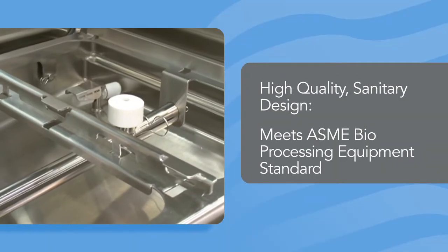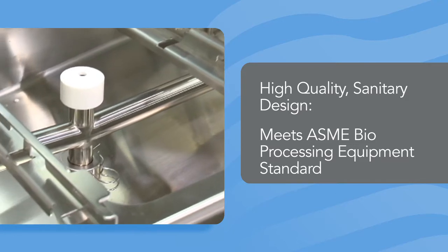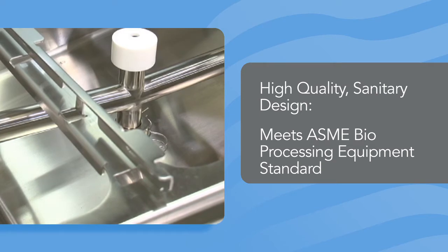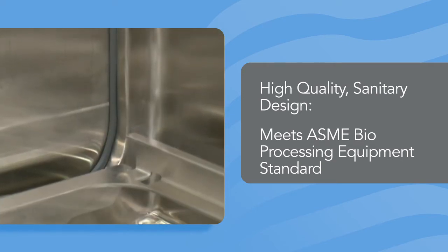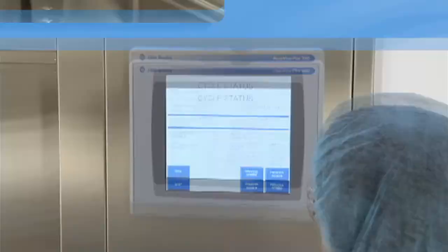The 380PG washer's sanitary design complies with the ASME bioprocessing equipment standard to prevent the risk of cross-contamination between loads. All welds are polished to achieve a high-quality surface finish and dead legs are limited to the strictest minimum.